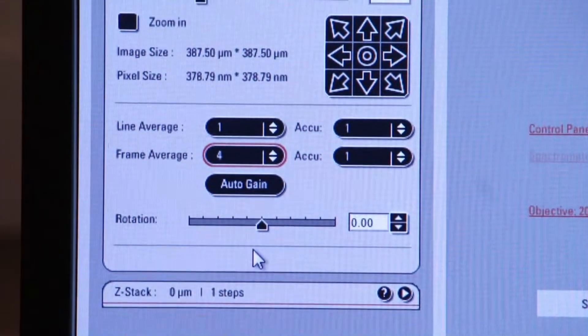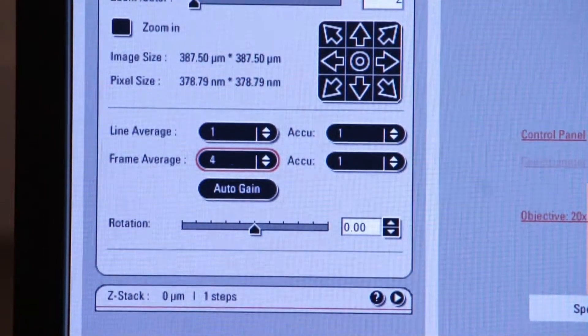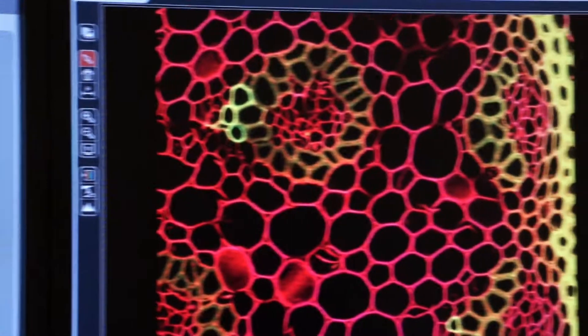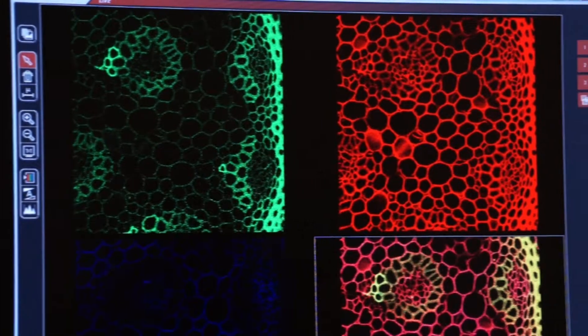So now we're going to average each of four frames together and let's see what our image looks like. I'll click on capture image. Watch the screen here and you'll see our high resolution image come up a little bit faster and a little bit grainier.